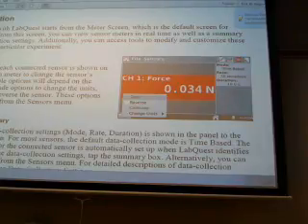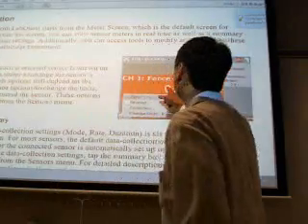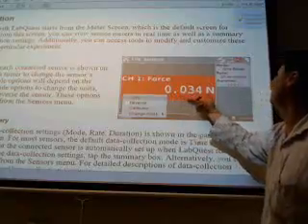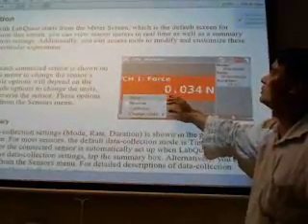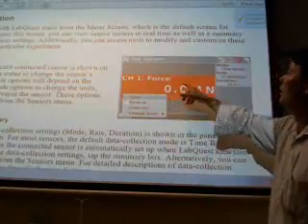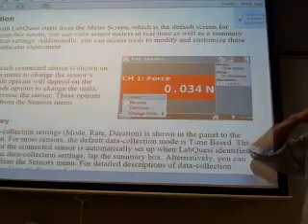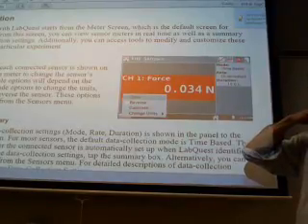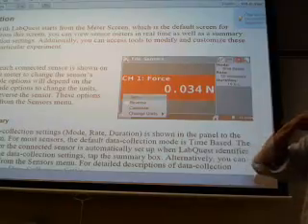We're on the meter screen right now. This is a different probe they have on here. This is a probe showing force here, but we have the temperature probes in here, and we have 2 of them, so you can see both of them. You can view sensor meters in real time as well. Are you viewing in real time? You have a real-time temperature output, right? Okay, that's good.